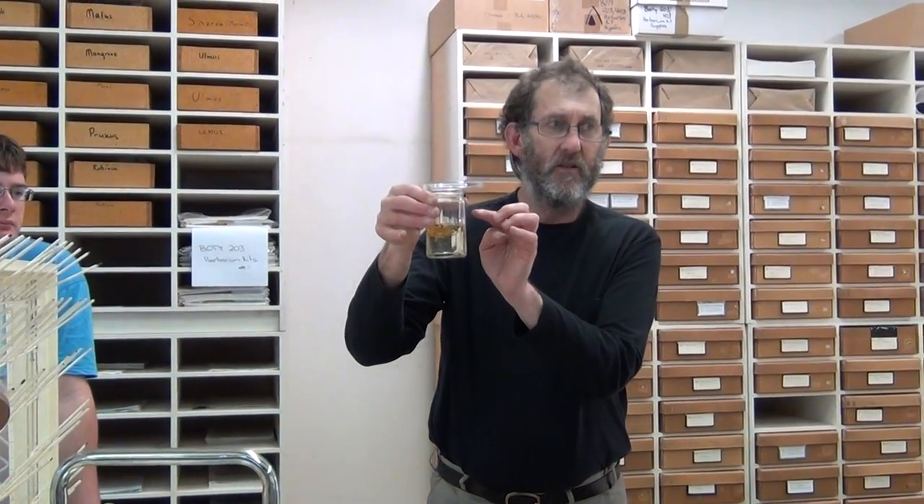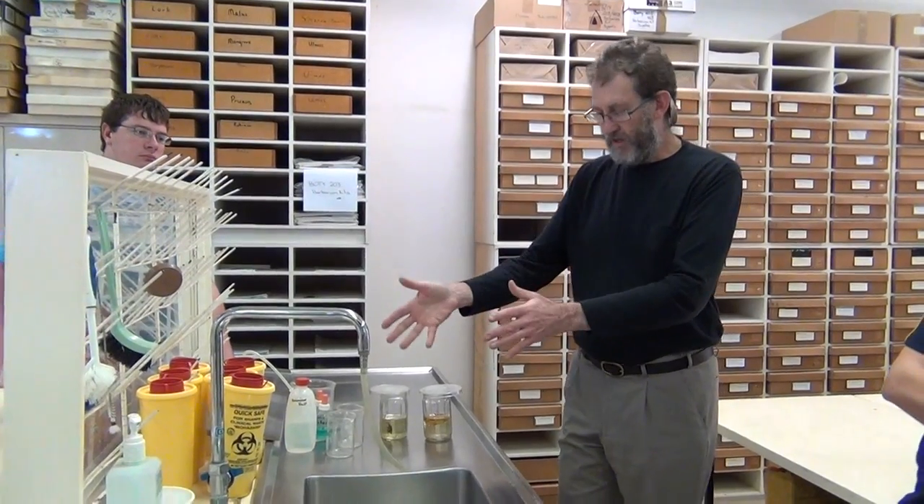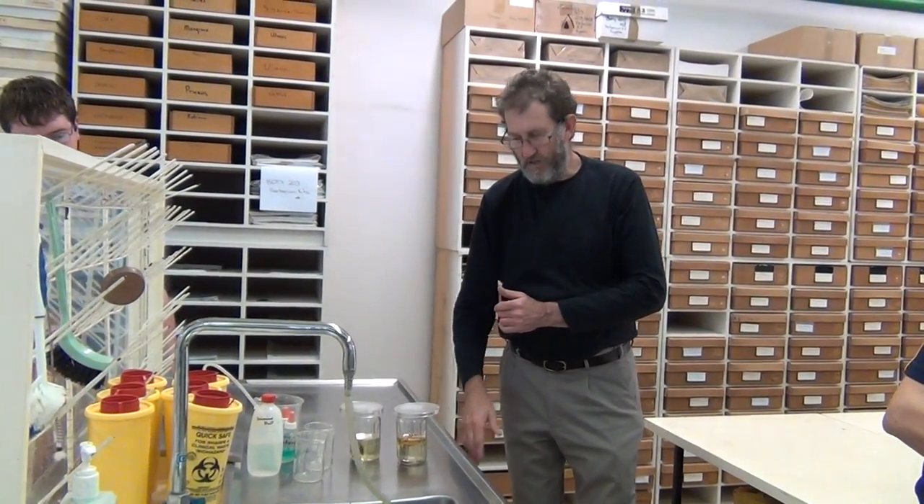There's no need to rush — if you're doing a session of identification, get these soaking, go work on other specimens where you don't need that material, and come back to these. Give it at least 10 minutes. Longer is fine; it doesn't matter if it's in there for a few hours. If you leave it overnight that's probably okay, but things can go mouldy or get knocked over. In the lab, rinse out the jars and put them back when you're finished; the detergent can be put away.